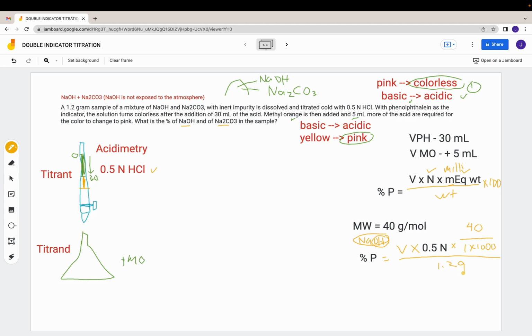So I hope you see the picture here. What we're actually looking for is your volume. And it's not what you expect, right? You can't really use 30 ml straight ahead. Why? You have to understand how our chemicals are changing when we're performing titration. In this case, there is such thing as double equivalence points. So how does this look like?